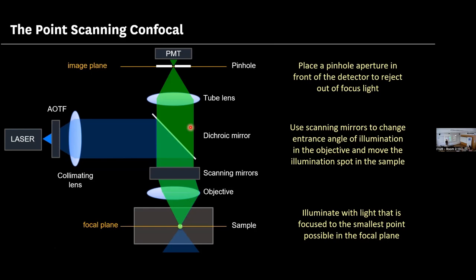In the confocal microscope, when you change the laser power, you are not actually changing the laser power. It's called transmission. It's the transmission through the acousto-optic tunable filter, not the laser power that you're changing. When you set it to 10% or 2%, it's the laser transmission through the filter. And usually you set it to, let's say, 2% or 4% to acquire an image of the sample.